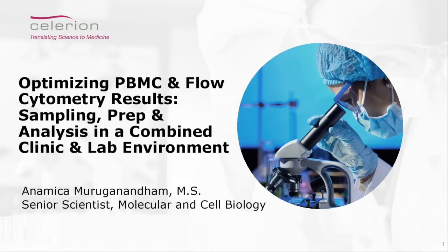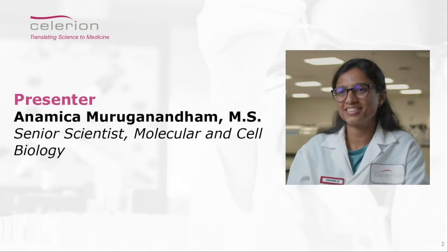Today, we will discuss the quality of sampling, preparation, and analysis and how it can affect flow cytometry data. We will evaluate how on-site clinical sample collection and on-site bioanalysis laboratory processing in real time enhances the quality of data. Today, we are fortunate to have Anamica Muruganandham sharing her scientific expertise to help position you, our clients, towards a successful understanding of how improving PBMC flow cytometry results supports exploratory and early phase clinical trial endpoints.